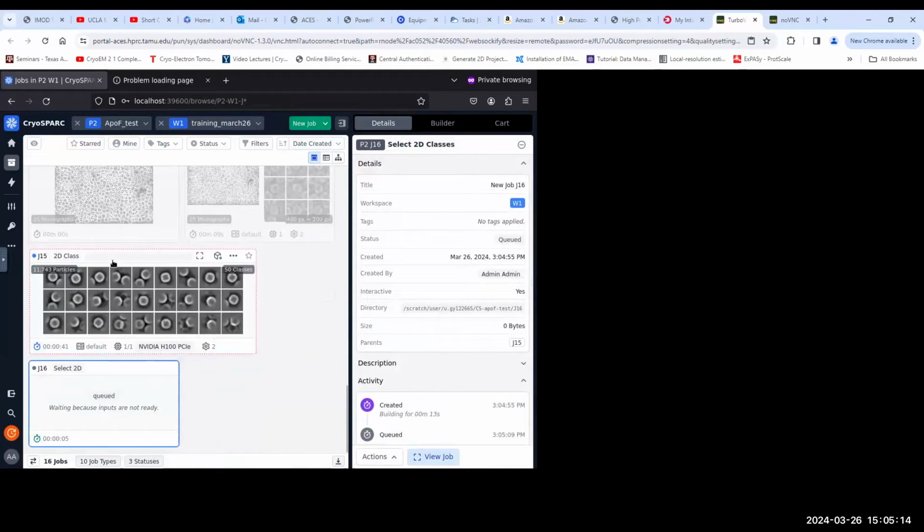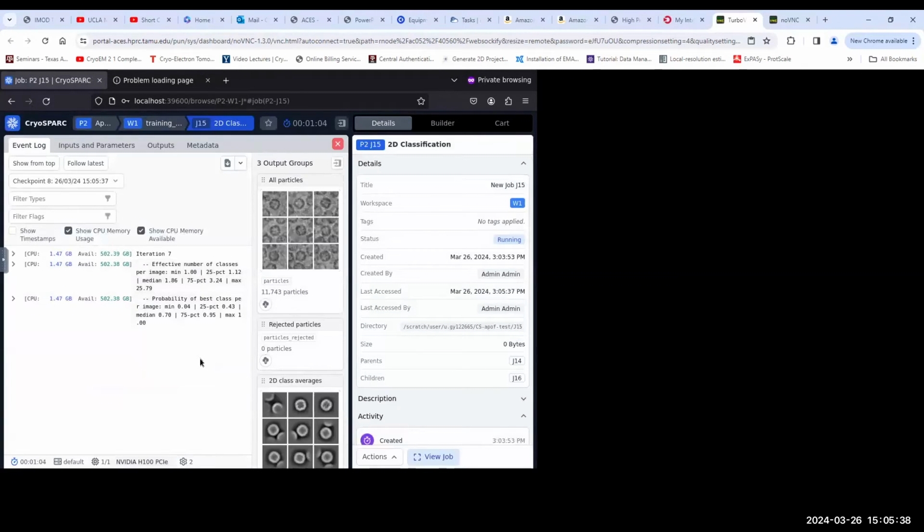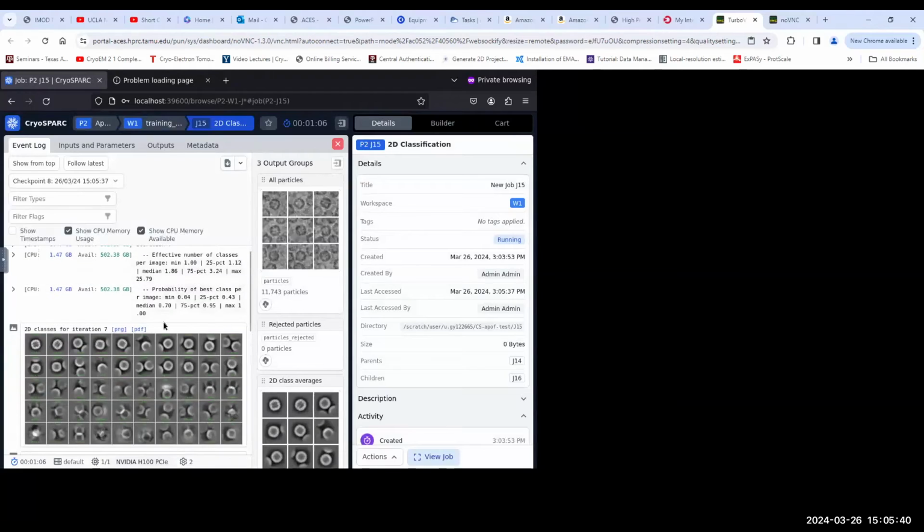Once the 2D classification finishes, the selection will start. View the job, or the status of the job right now.